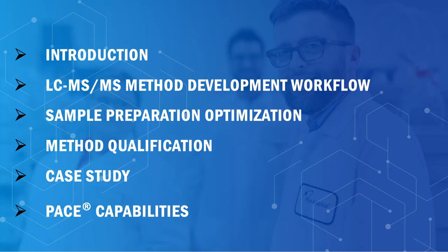Today I'm going to talk about bioanalytical method development for lipids in LNP formulations by LC-MS/MS. I'll briefly introduce you to the topic of the presentation and will discuss in detail the workflow associated with the development of an LC-MS/MS method, followed by sample prep methods and optimization.